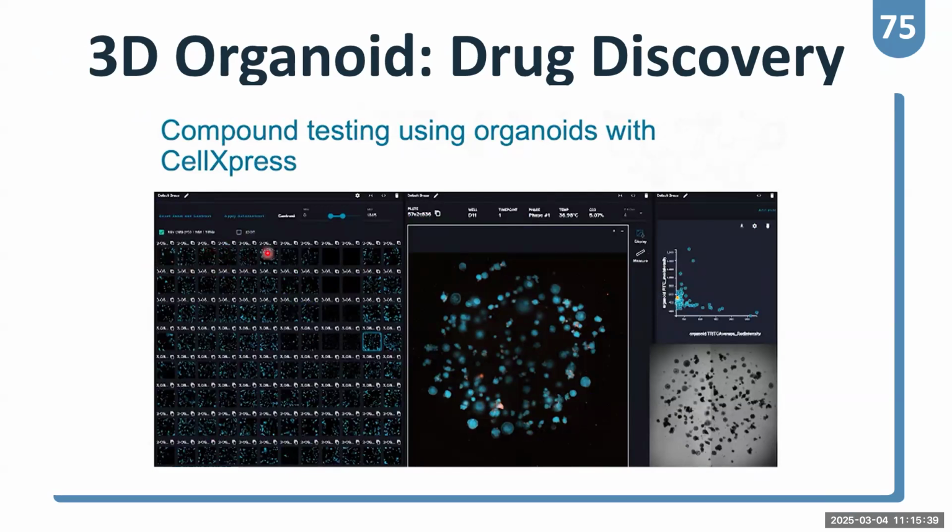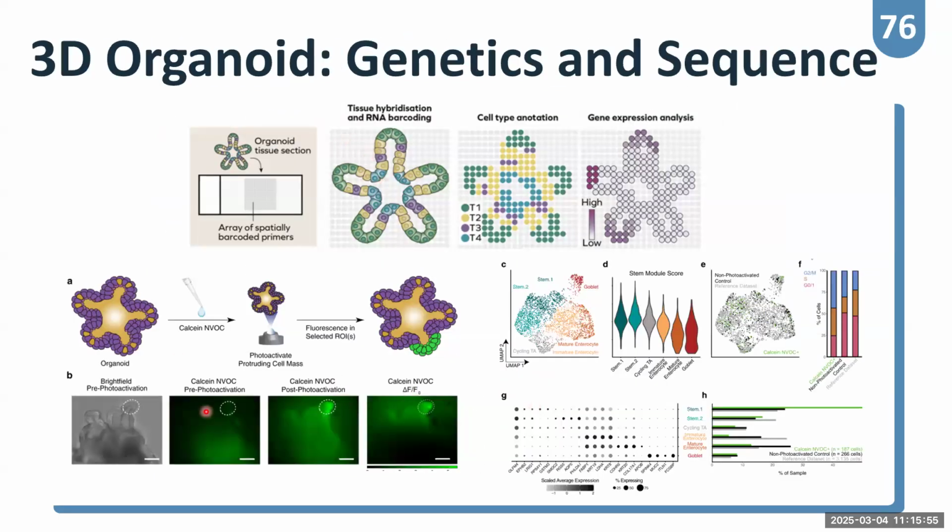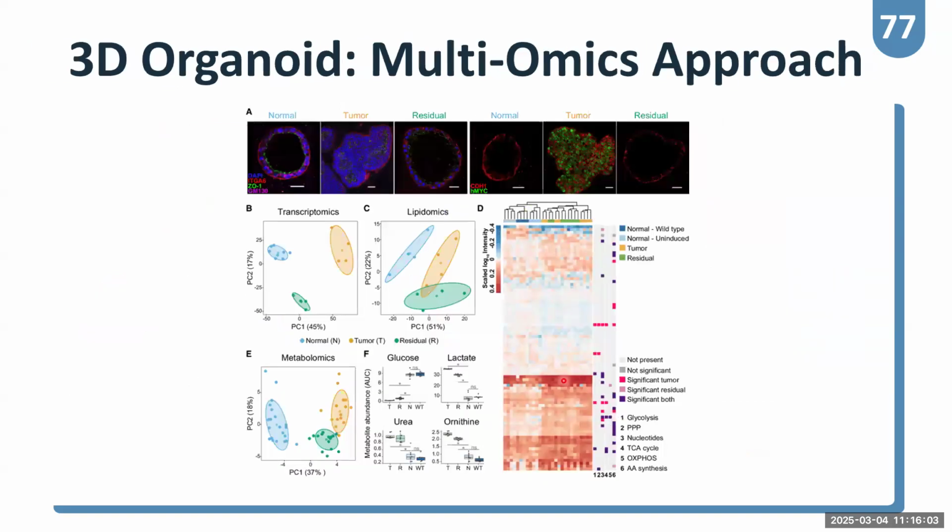I think this is a 96-well plate or maybe a 384-well plate to observe the organoids inside, and they can report the size and the number of organoids in one well for you. Okay, and now they have AI, single cell analysis and omic analysis to study the gene profile in one organoid and compare each condition for you.